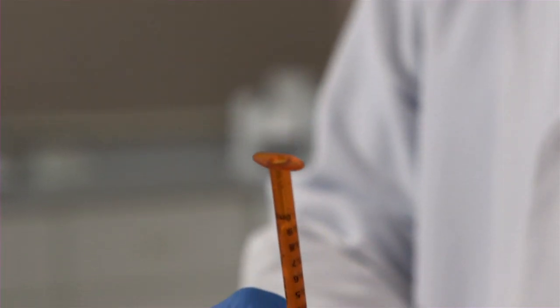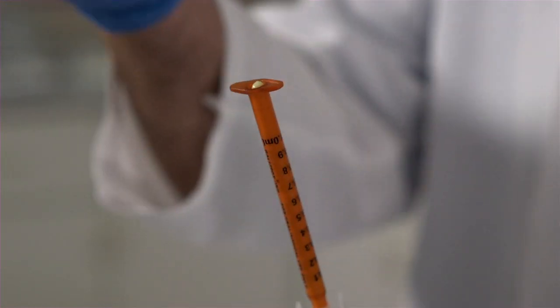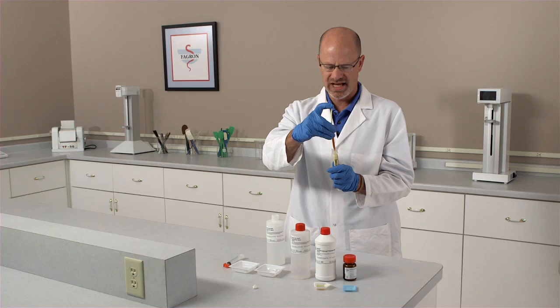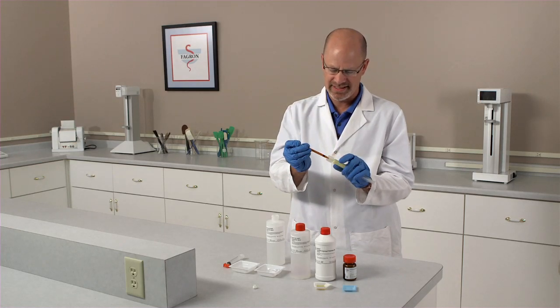We do this in order to get rid of the air that would be in the hub if you keep the plunger in the device. The last step is to replace the plunger and push down to the desired dose. In this case we'll do a 0.1 cc.